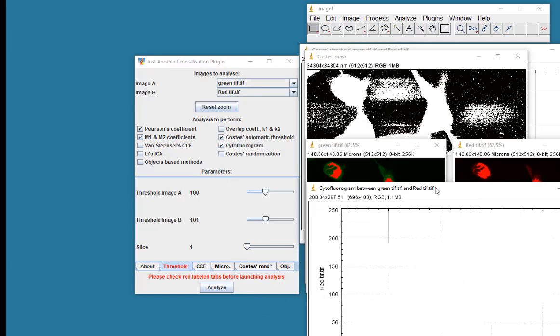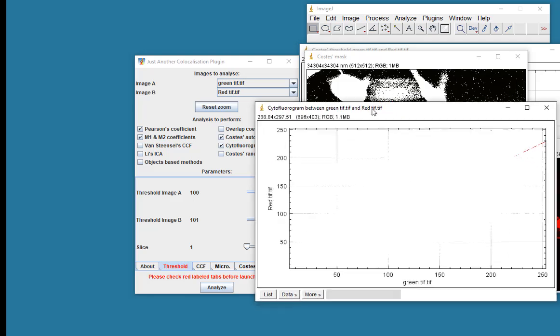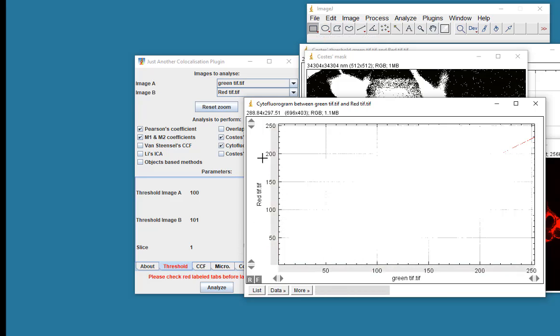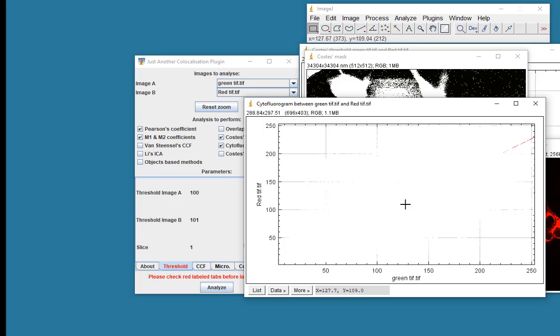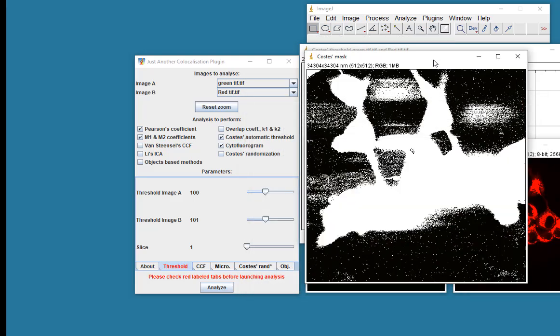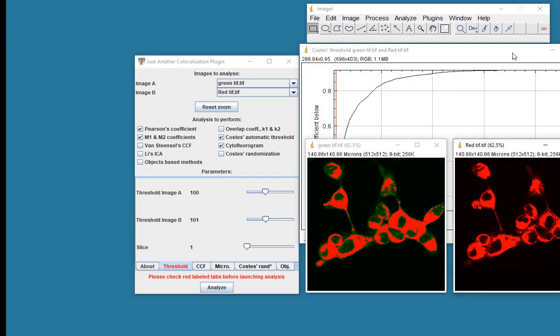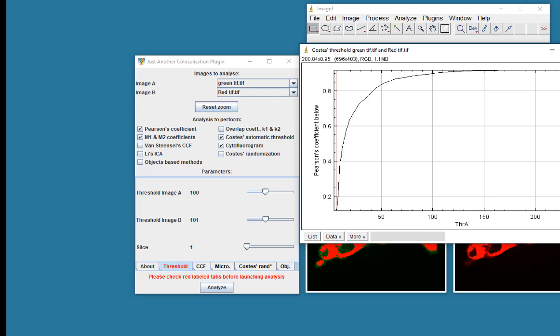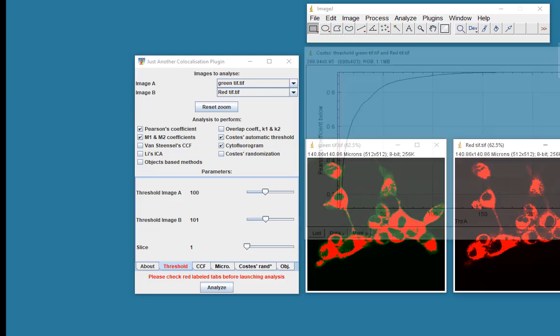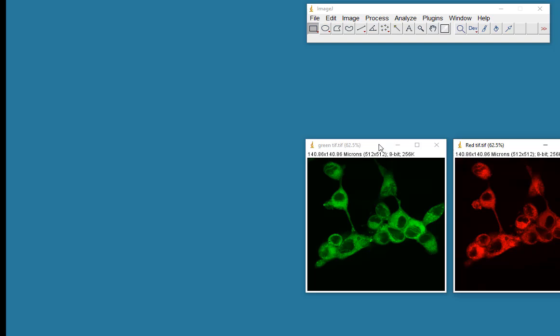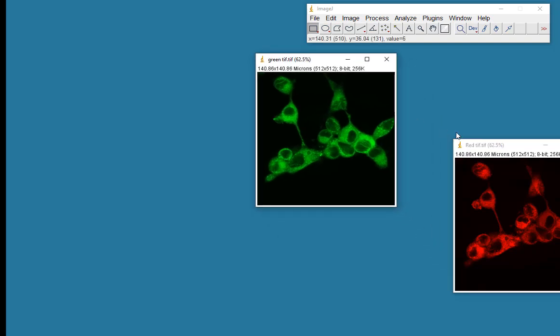Now one thing that I like to look at is the cytofluorogram, which is a plot of the intensities of the green pixels plotted against the intensity of the red pixels. And for some reason on my PC here, the cytofluorogram doesn't show up particularly well. So I'm going to use a different program to show you the cytofluorogram. This is just the Costes' mask that was used. This could be quite interesting here, which shows you the Pearson's coefficient value as you use different threshold values. But I don't think we'll use that for the moment.